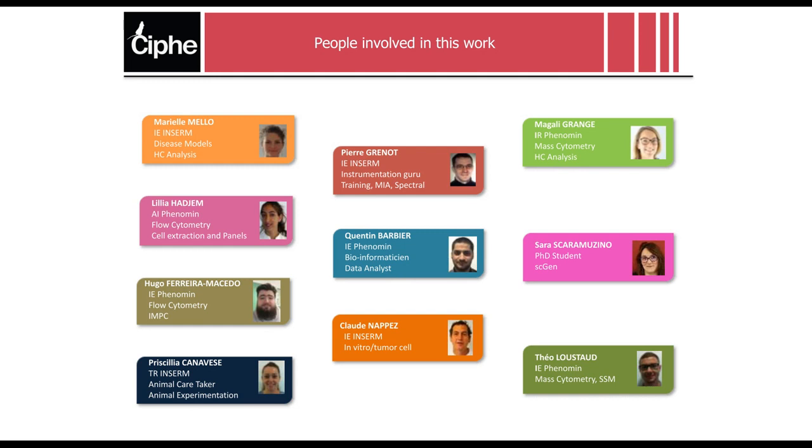Then it's also very nice because I have my way to analyze the data, and maybe that won't fit the way of my collaborators. But because I share the data set and illustration, they can, with their license, reanalyze the same data set their own way, and then we can discuss what overlaps and what doesn't, so that we are all on the same page. For me, this is a lot more rigorous, because you get the expertise of several people looking at the data set.